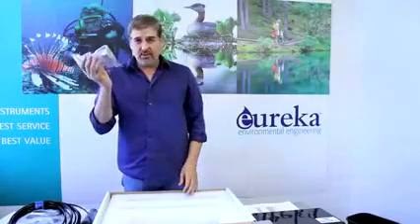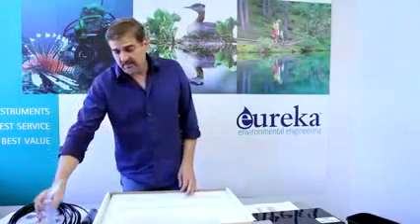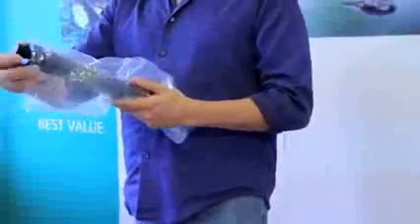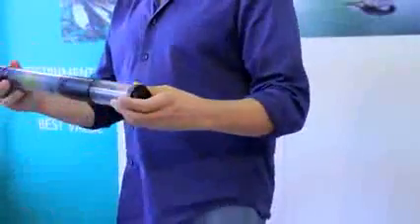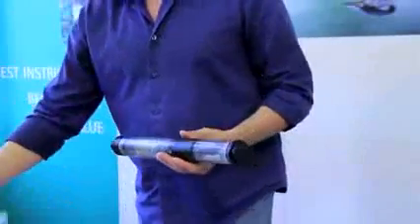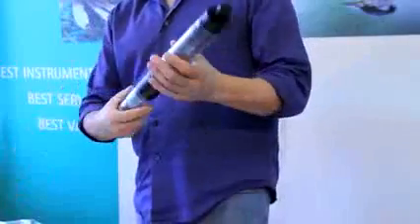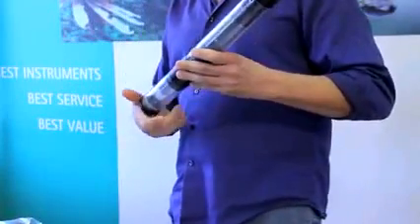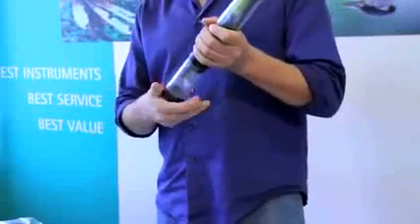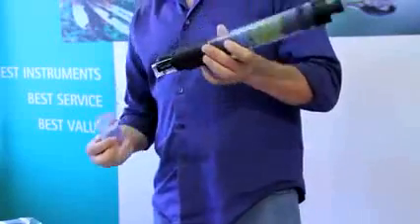Weighted sensor guard, which we'll put on there when we deploy it in the field. And this is the MultiPro. This one happens to be a Sub 2 with Big 4, which is temperature, pH, conductivity, which is also salinity and total dissolved solids, and optical dissolved oxygen.